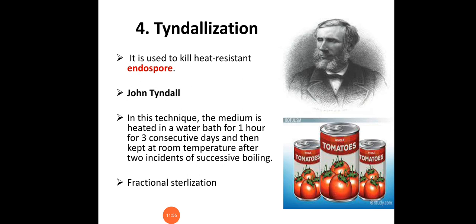In this technique, the medium is heated in a water bath for 1 hour for 3 consecutive days and then kept at room temperature in between, like successive boiling. Pickling and some food preservation also use this process. It is called fractional sterilization.